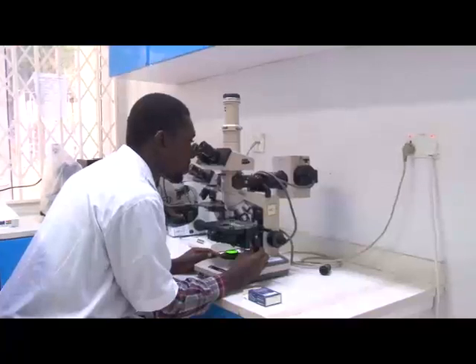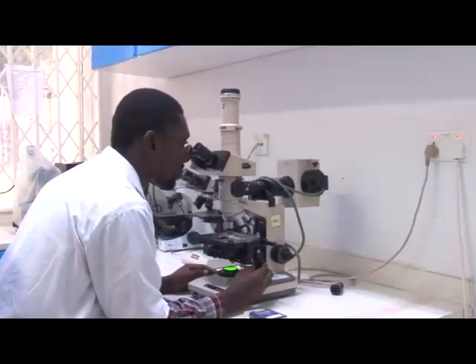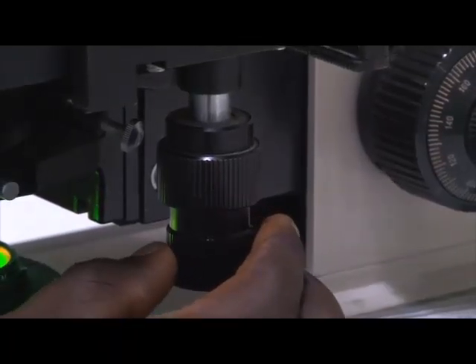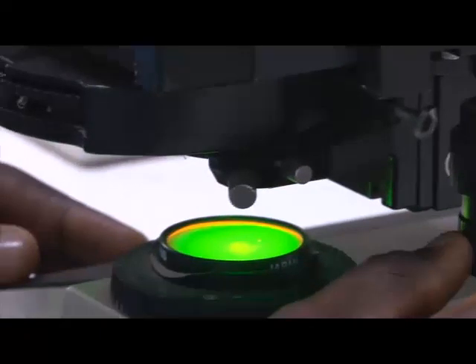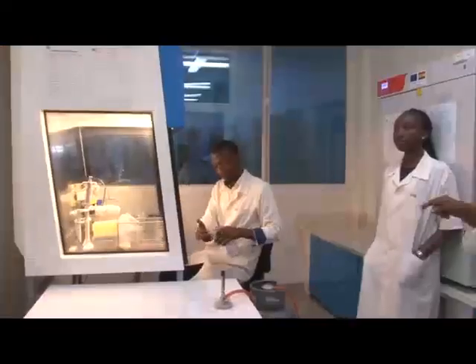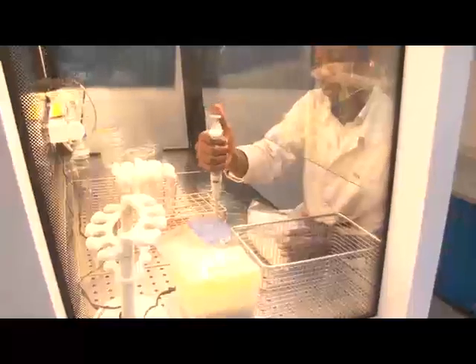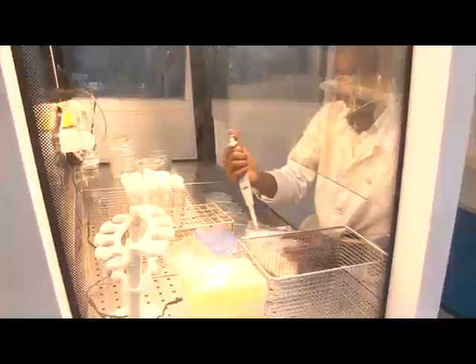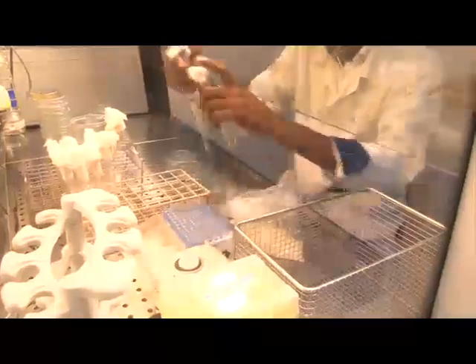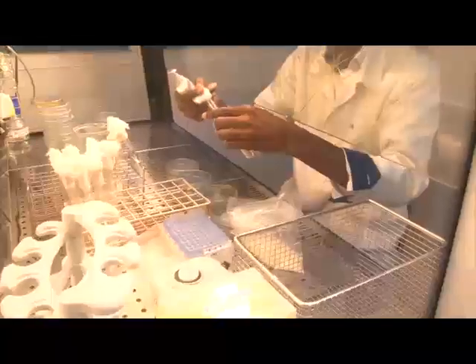The lab scientist doing food analysis follows a guide not to introduce external contaminants at any stage of the process, so the sample remains in its original state. Here, you can see professionals sanitizing their hands before moving to the next stage, where items are placed in a safety cabinet. The sample is broken into bits, diluted to loosen the compact sample and allow ingredients in it to be properly identified or assessed.